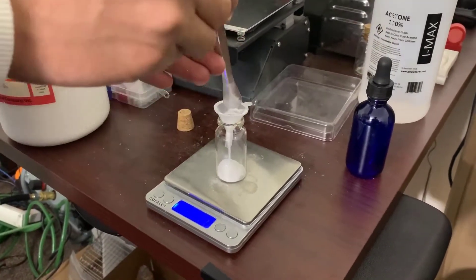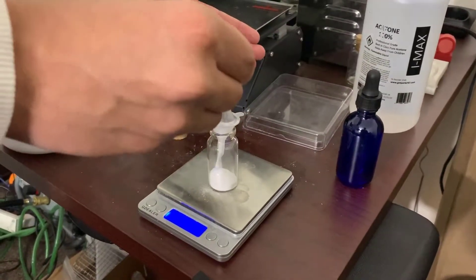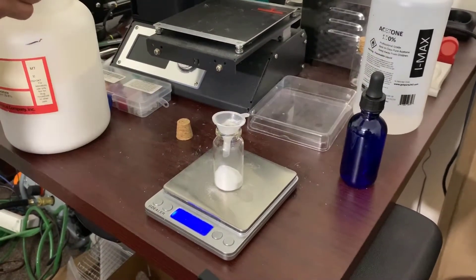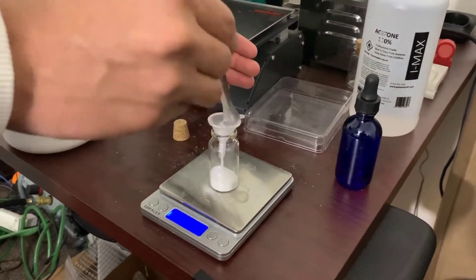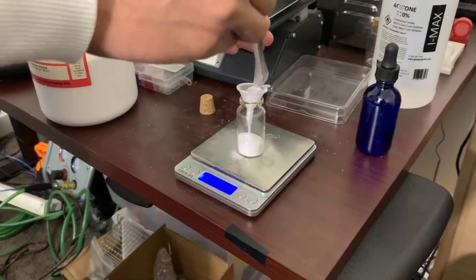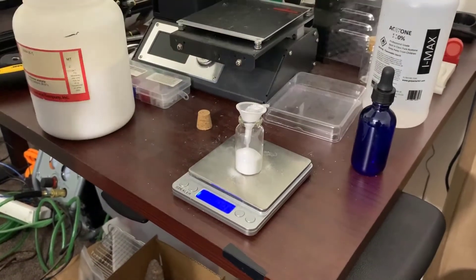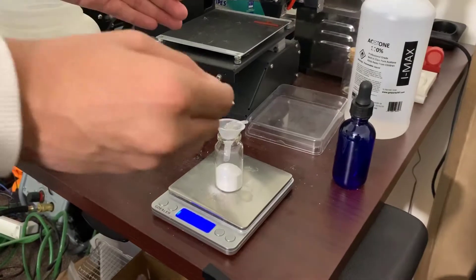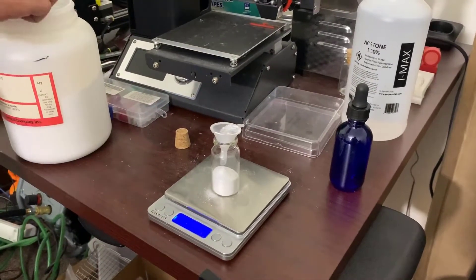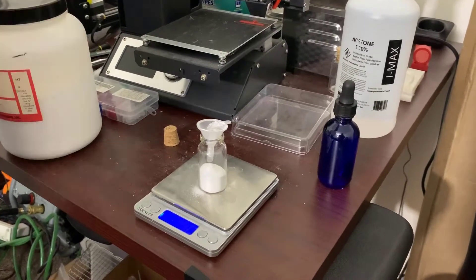You can just use the funnel and place it in there. We're going to get about 4 grams of cellulose acetate and you want to be as precise as you can. A little bit of error is fine — it should not influence your results too much. But you want to try and get as close to 4 grams as you can.